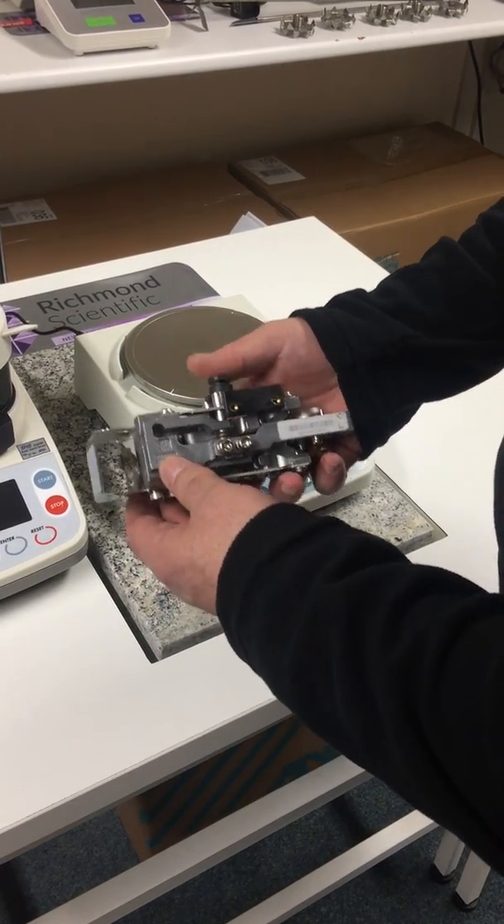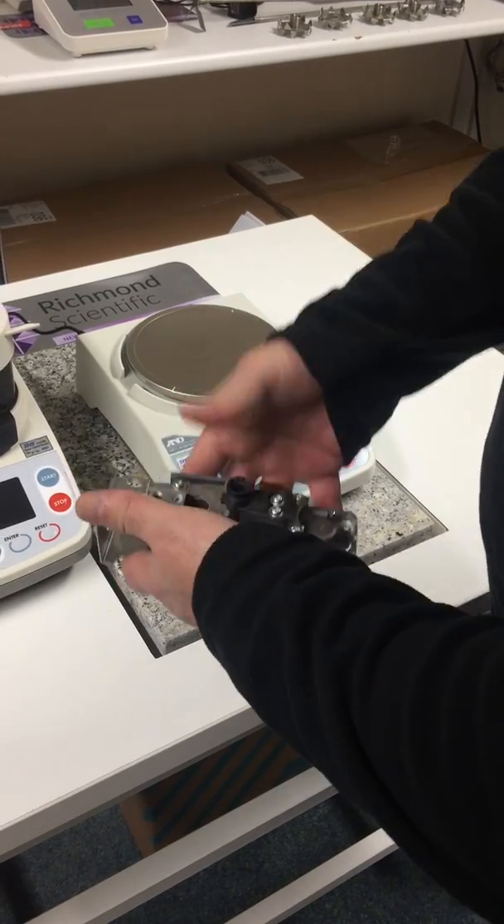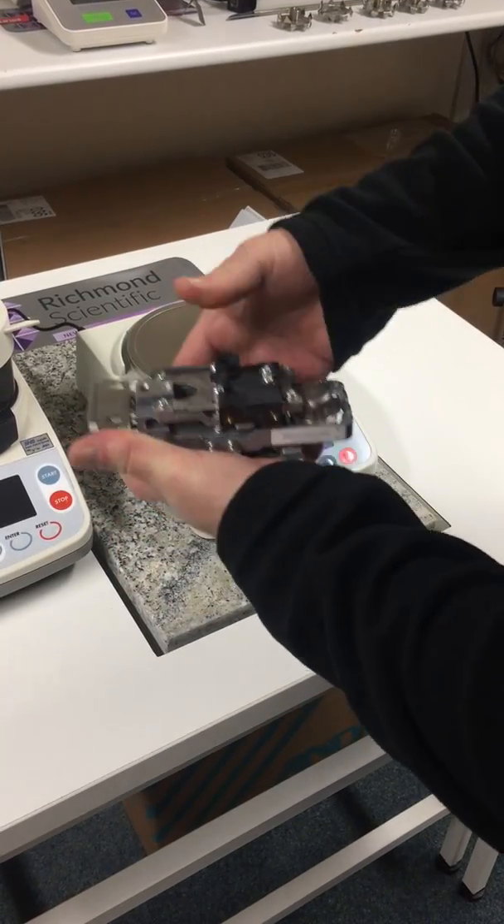I'm now going to give a demonstration. This is the heart of the machine, and if you can see, it doesn't matter how hard I press that — it will not break.